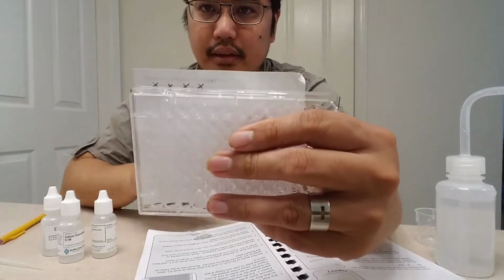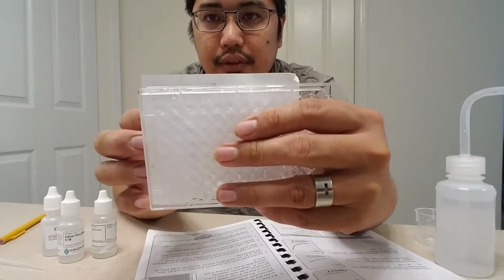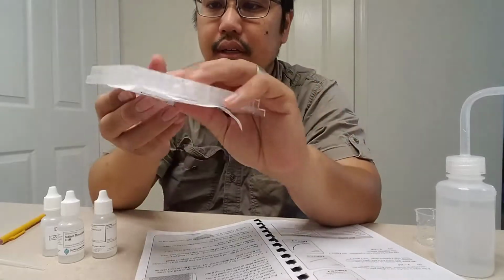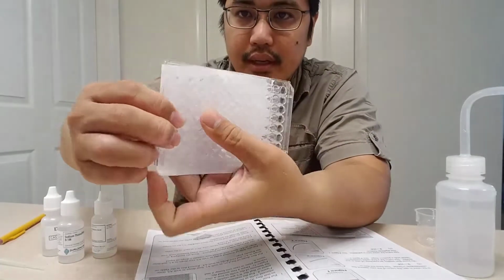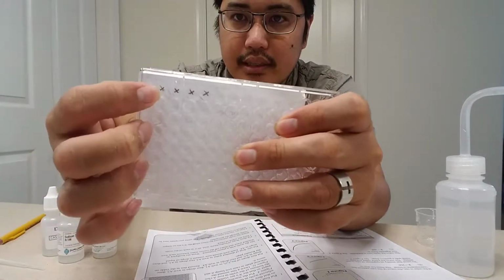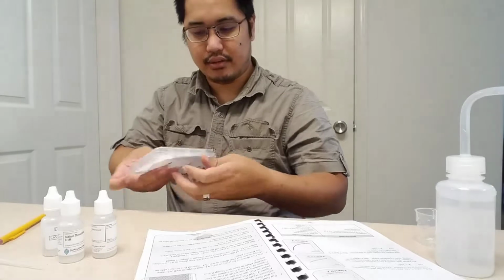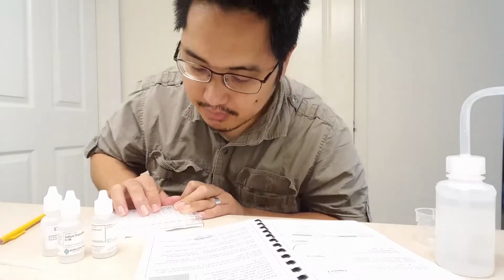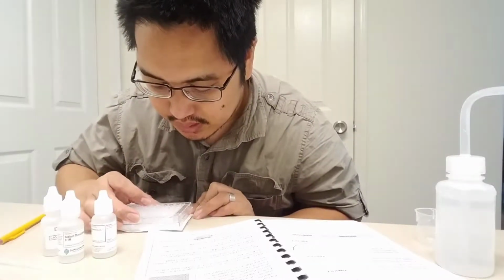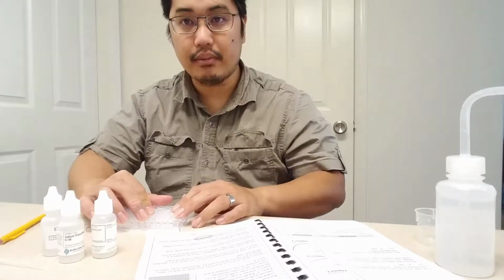So here's what I got. These little X's, and I have them above the circles. Hopefully, if I did it right, there we go. I can line it up so the X's appear inside the circles. Obviously, they're not inside the circles, they're on the paper, but I'm going to do an experiment, and a precipitate will form that makes it cloudy, so I won't be able to see the X's.